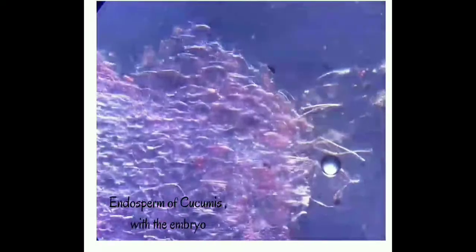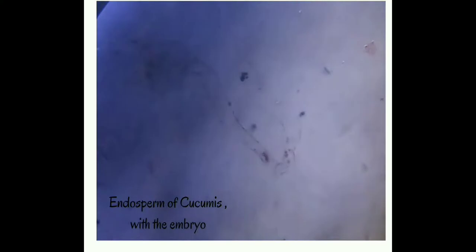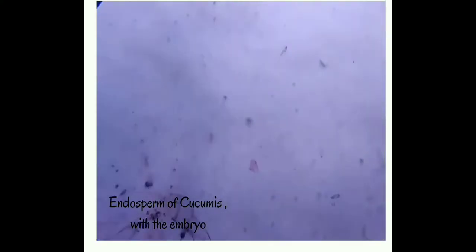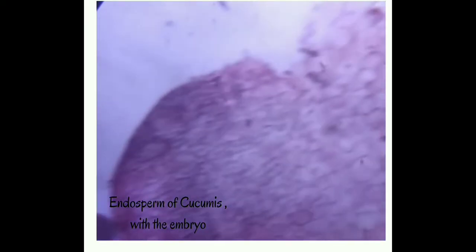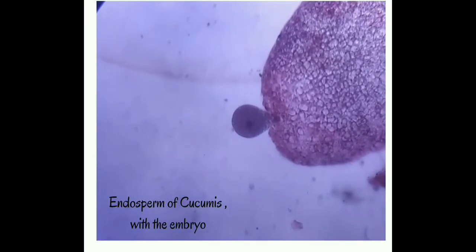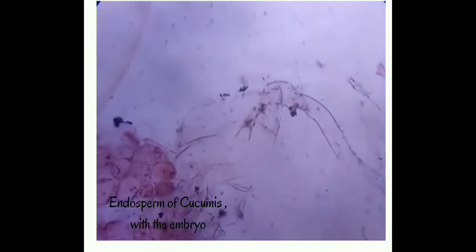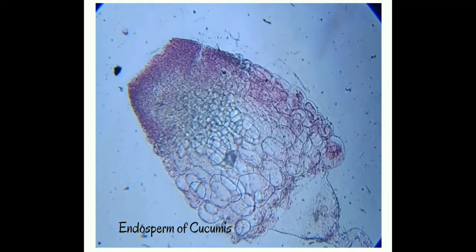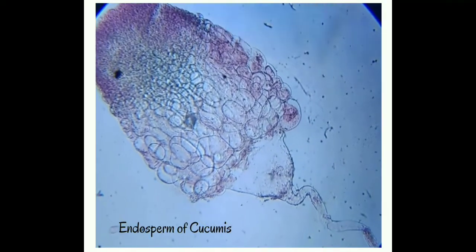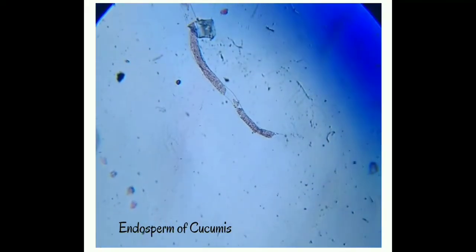This is the endosperm of cucumis with embryo. You can see the embryo at the tip — it is the haustorium. Here is the proper endosperm, and at the tip you can see the embryo. Here you can clearly see the free chalazal haustorium with dense cytoplasm and many nuclei.